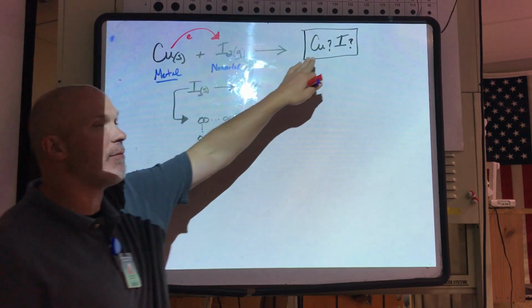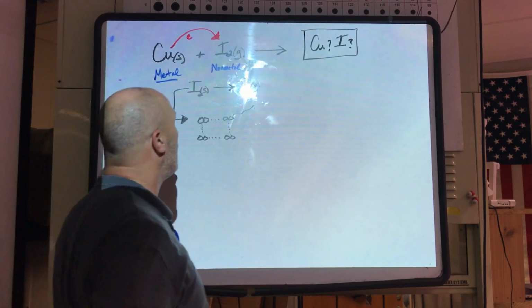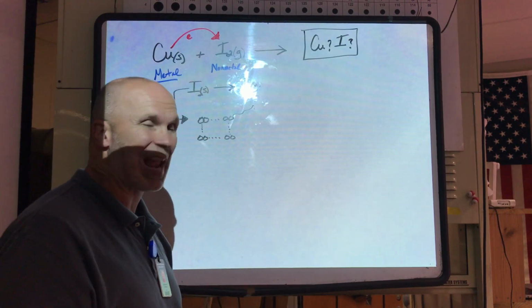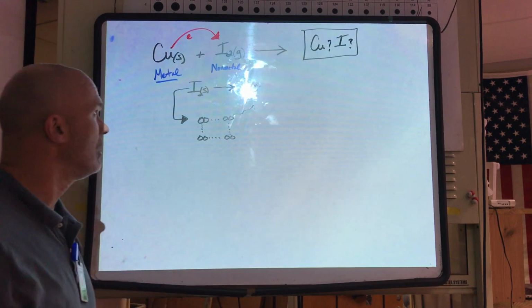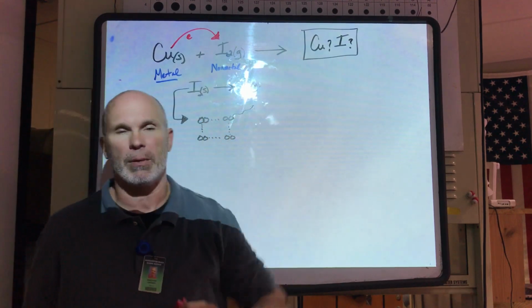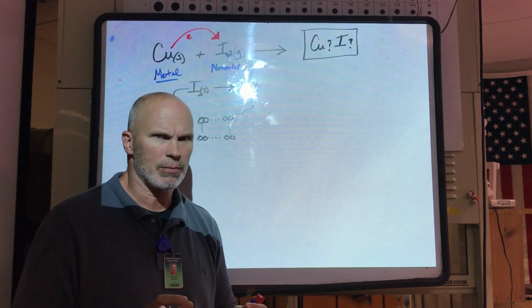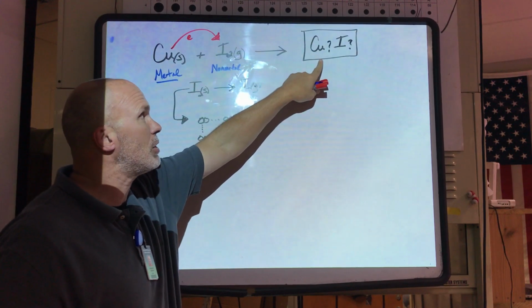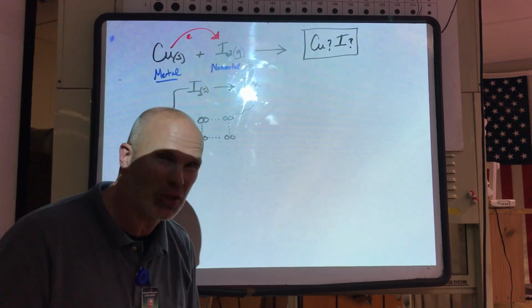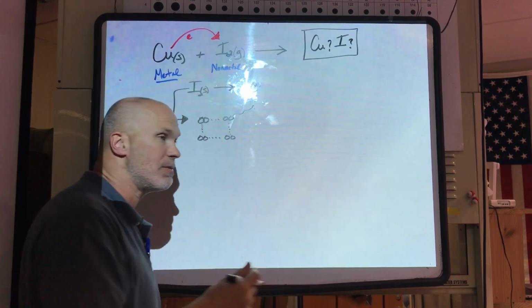And of course, once we have this chemical formula of the salt, we can backtrack and figure out the ratio of the other compounds in order to do some stoichiometry or more analytical chemistry, so that we can predict the products. So let's talk about what we have to do in order to get this empirical formula. We should always think about it as a many-step process, not what you do first, but what you do last. We're trying to find the lowest ratio of particles, not a ratio by mass. This is a ratio of particles, mole ratios. We use the word mole to have a how-many number. So how many coppers compared to iodine are in this ionic crystal?